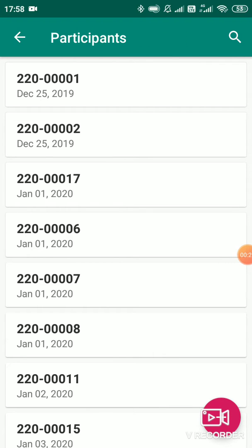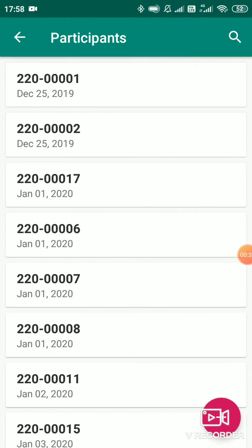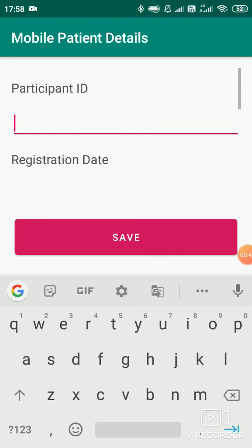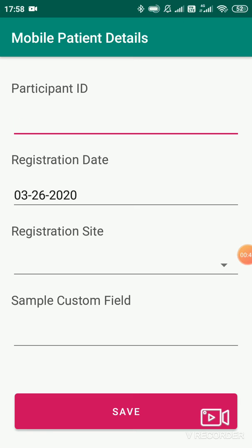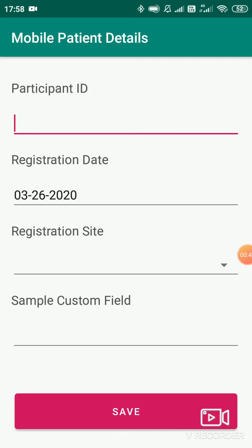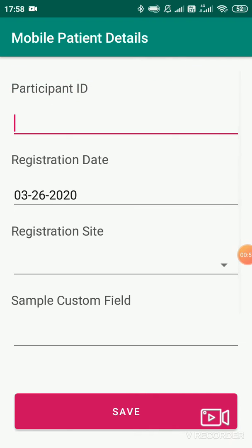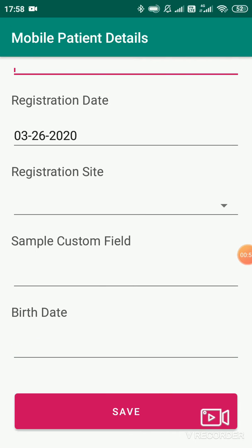Once you click on the collection protocol, you will get reverted to the participant list view page. Here is the list of participants that already exist. By clicking on the plus sign on the right-hand side, you can add a participant. The fields are added as per the client requirement — participant ID, registration date, site, etc. These fields can be modified and changed as per your requirement.